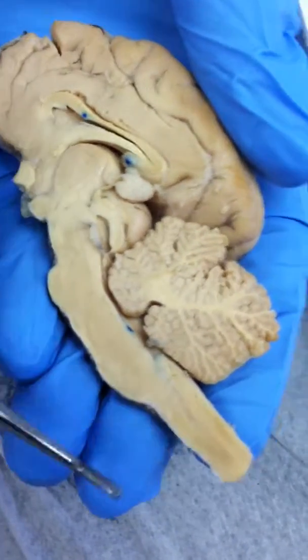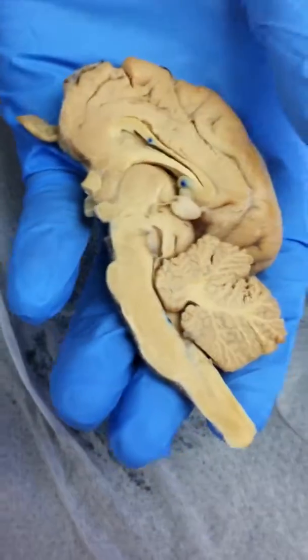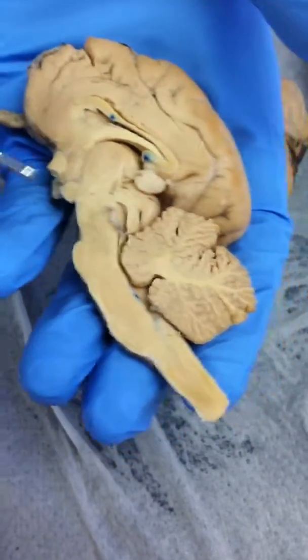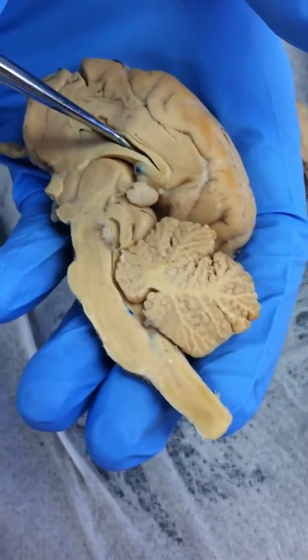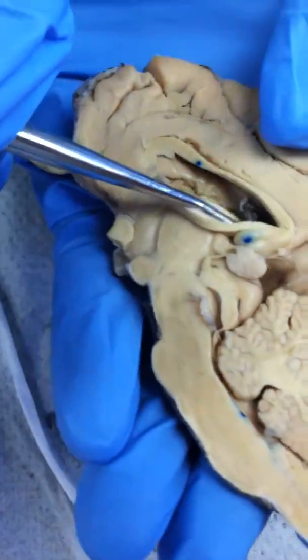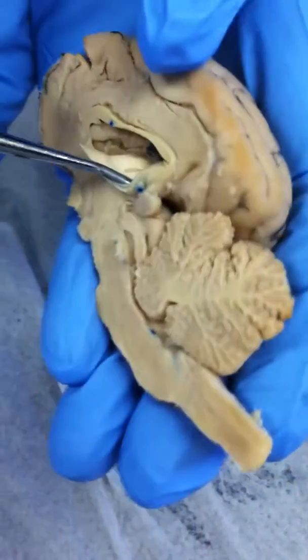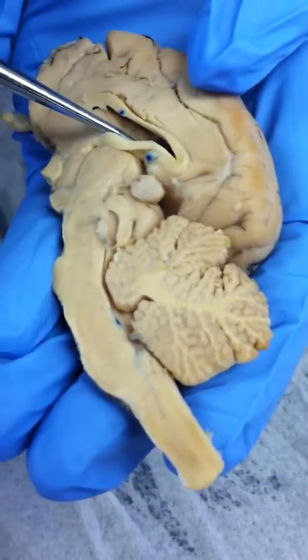The choroid plexus is what makes the cerebral spinal fluid. It's a network of capillaries that are in the lateral ventricle, and they make the cerebral spinal fluid. And you can't see them? You can, kind of. You see it? Black. Oh, okay. It's black. Choroid plexus, the black thing.